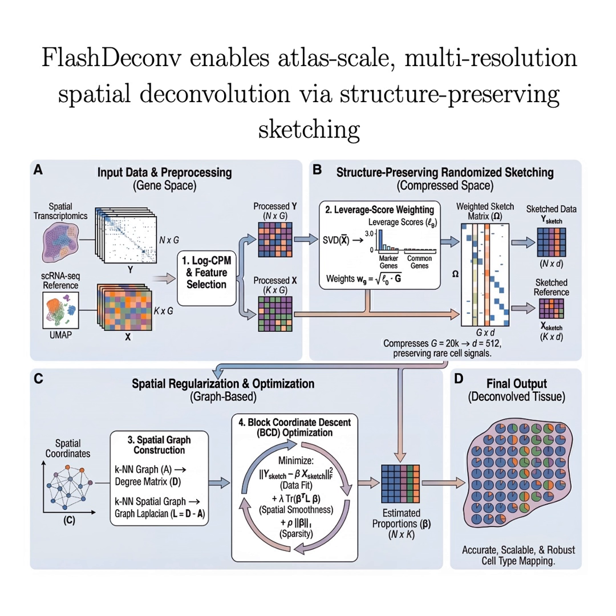Yeah. At 8 microns, over 60% of the measurement spots were highly pure, meaning dominated by a single cell type. But as soon as they crossed that 16-micron line, that purity just collapsed. It dropped by 78%. And why is that specific size, 10 to 15 microns, so important? It aligns perfectly with the physical size of the intestinal epithelial cells. Once your measurement bin is bigger than the cell itself, you're just averaging multiple cell types in every single spot.